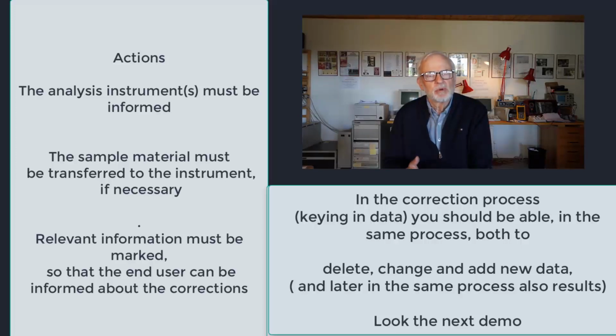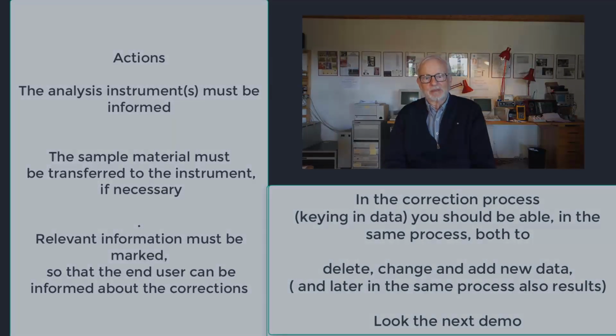As you can see, the reporting is one of the more demanding functions both in the lab and in the IT system. But it is important that it is there. But let us now go to the demo on the system, and please notice that the information I have told you about here is present in the form. Okay, let's go.